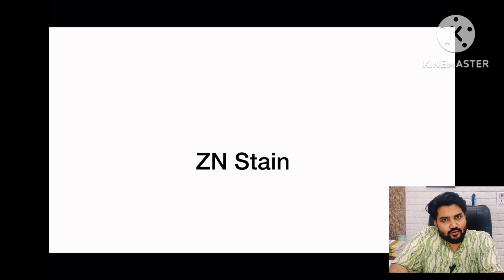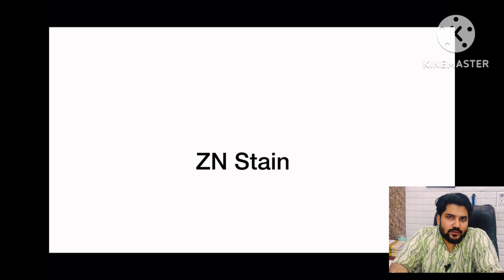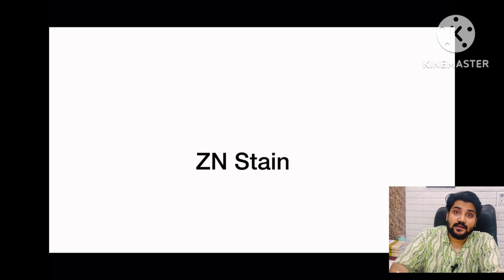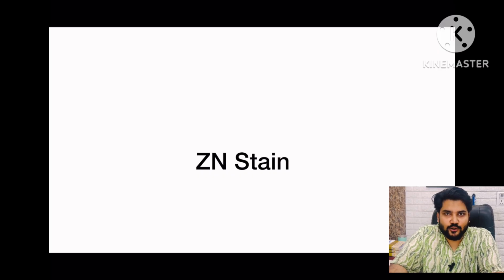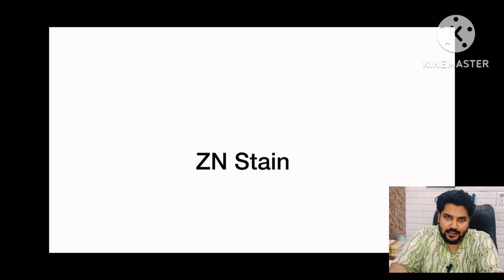Okay, so what we are going to read today, we will read the important aspects of ZN staining. मीन्स कि ZN stain में क्या क्या चीजें होती हैं, उसकी गाइडलाइंस क्या इंपॉर्टेंट हैं. सबसे इंपॉर्टेंट ये है कि जो भी हम ZN स्टेन पढ़ते हैं, अपन कुछ भी पढ़ लेते हैं, तो दैट इज नॉट इम्पॉर्टेंट. सो इम्पॉर्टेंट थिंग इज देयर आर टू गाइडलाइंस.